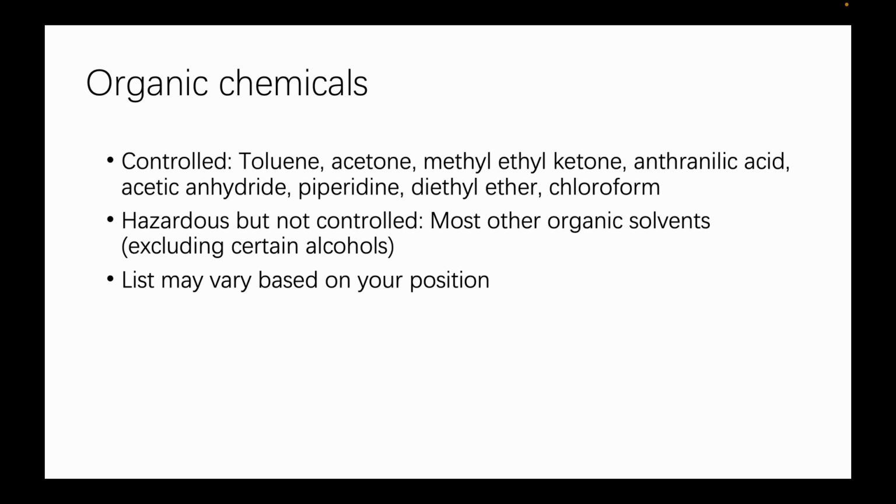So here are the organic chemicals. It's a rather shorter list, because the difference between controlled chemicals and hazardous chemicals here is not that much, since most organic hazardous chemicals are usually not sold around. For example, among the organic solvents, toluene is controlled and acetone is controlled, but there are others. I just can't think of one off the top of my head, but that's fine. Just know that a lot of organic solvents are hazardous, so they can be quite hard to come by, especially in the high grades you'll need for experiments. So that poses a slight difficulty.